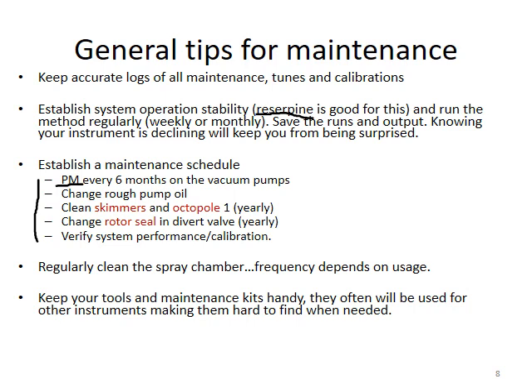For this vacuum pump, usually the service engineer will help you to change the pump oil. And also, you need to clean the skimmers and octopole. Usually, for these two cleanups you have to vent the instrument before you can really clean the skimmers and octopole, and this can be done on a yearly basis.